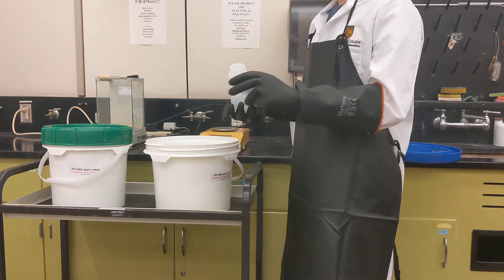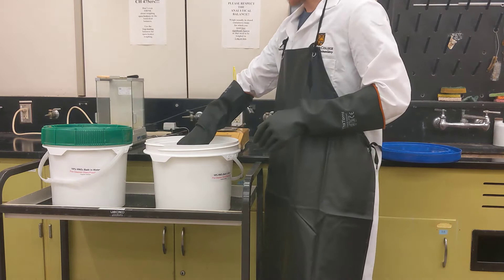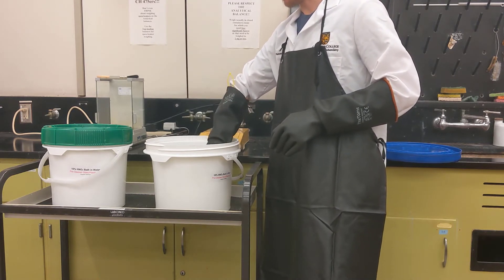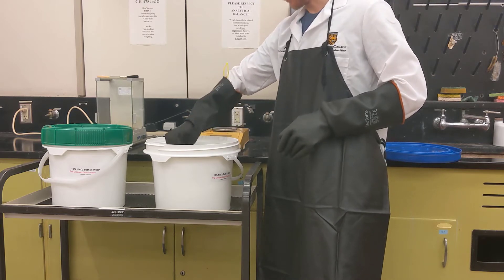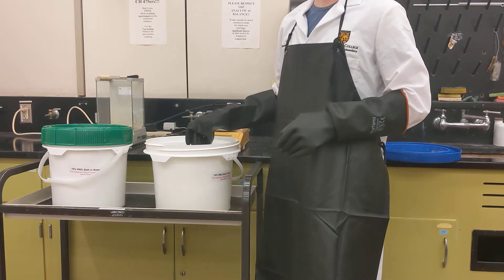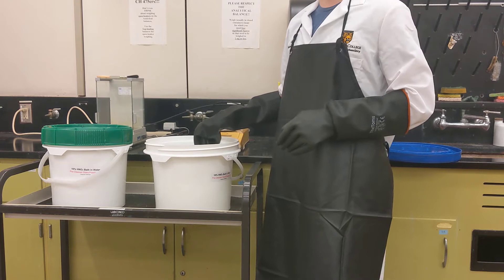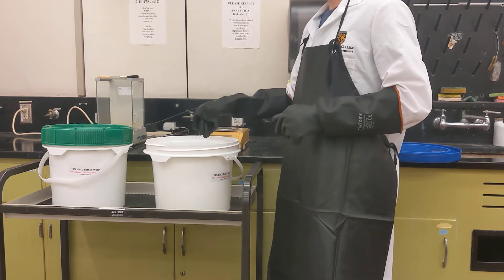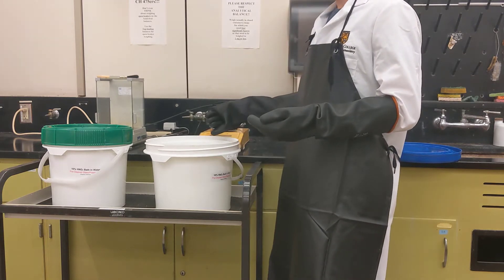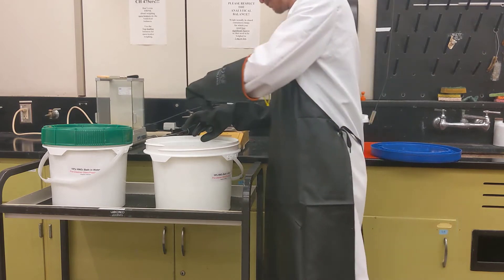Make sure the items are completely filled with the acid fluid, and be careful not to splash as you're adding them into the bath. All items should be completely submerged. For metals cleaning, items need to be submerged for at least four hours — typically you want to set this up in the morning or afternoon, set a timer for four hours, and then retrieve your items.